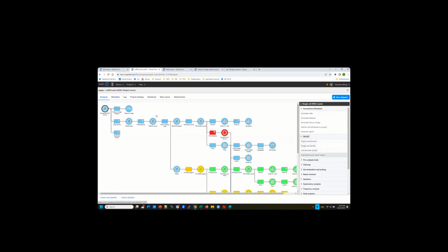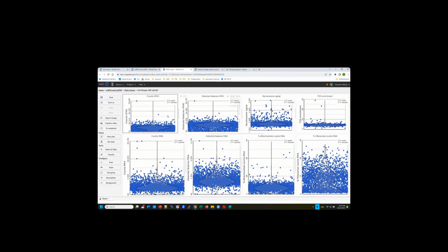It's the same. Actually, the concept is very much the same. So once you perform single cell QA/QC, you're going to have the QC on the ATAC data, and you have the QC on the RNA. RNA, we're kind of familiar. We look at the y-axis. This is the total number of UMI counts. This is the total number of genes we detected, the non-zero ones. Mitochondrial percentage, ribosome percentage, right?